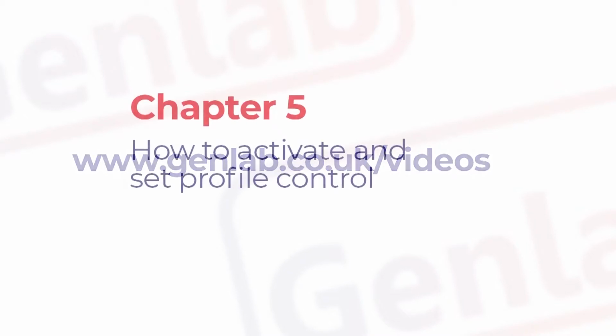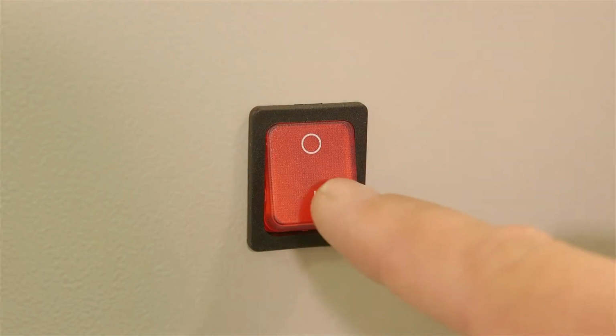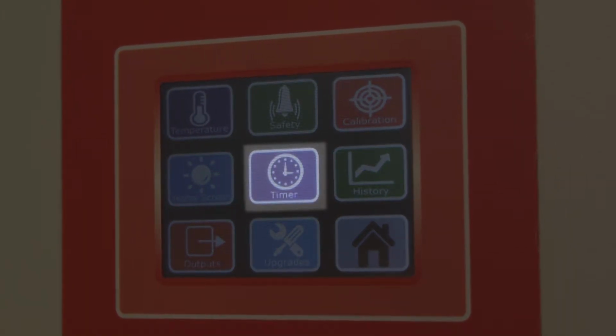This chapter is on how to activate and set profile control. The timer feature is only available on certain oven ranges. If you press the configuration key and see the screen has a timer logo, you can follow the steps in this video to change the timer function.